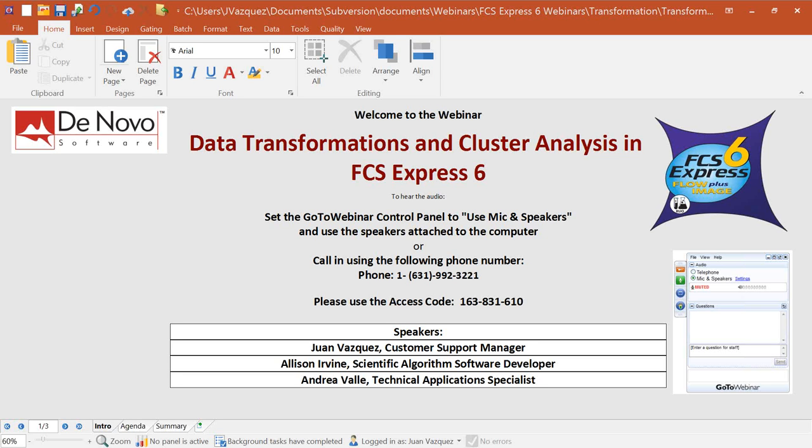FCS Express 6 now allows you to use data transformation features to quickly define, access, and use data transformations such as tSNE, K-means cluster analysis, principal component analysis, or PCA, parameter math, as well as giving you the ability to integrate R scripts for your data analysis. In today's webinar, we're going to try to cover all of these different transformations that are available in FCS Express 6.